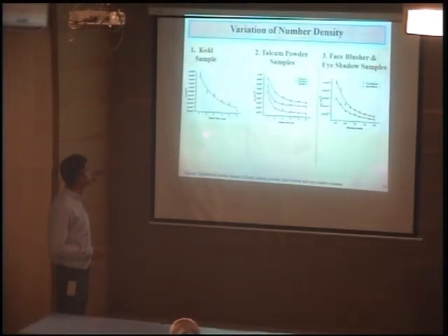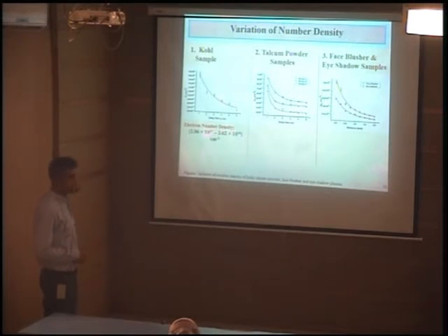The variation of electron number density for the Kohel sample is from 2.06 × 10^17 to 3.62 × 10^16 cm^-3. The electron number density for the Kohel sample varies along with the delay time.